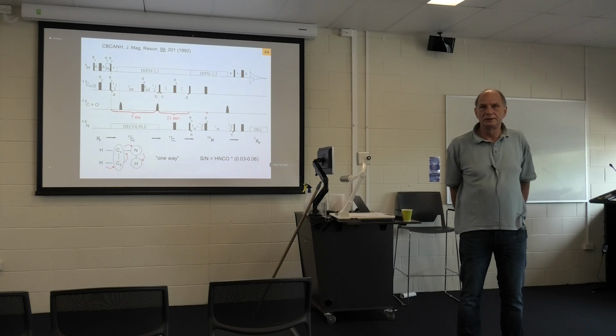So in many cases, you don't see the loop regions. I think this may be different at lower pHs, but we usually work at pH 7.